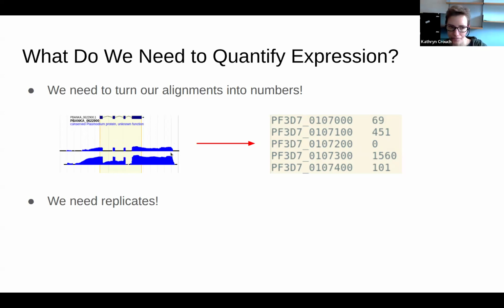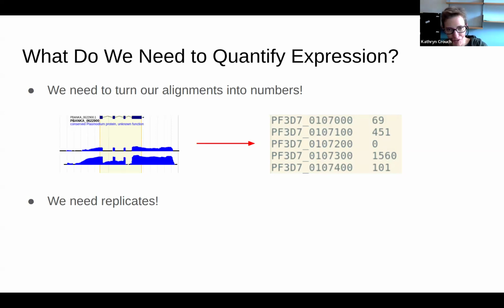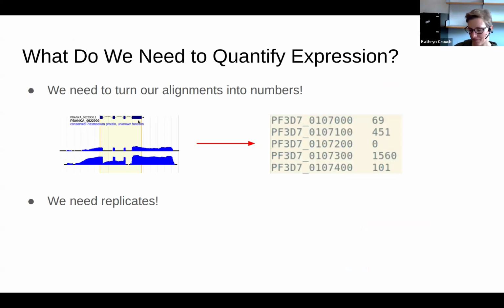that happened. Okay. So the very basic way of quantifying our data is to simply count how many reads align to each gene. That sounds straightforward, but the reality is that, as we just saw, the gene models are not always correct, and you can get some weird things happening in the alignment. So the simple case is we have a gene and the read sits purely inside that gene. But you can also get reads that overhang the end. For example, that is probably happening here.